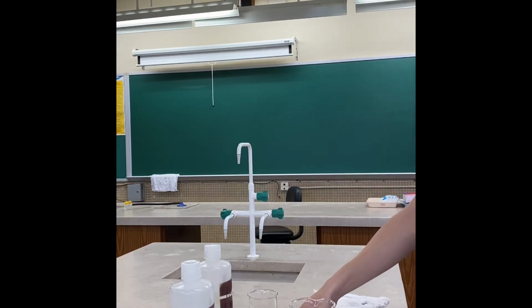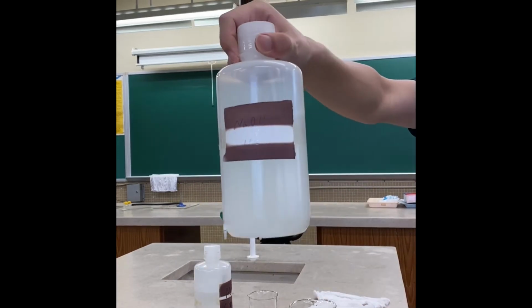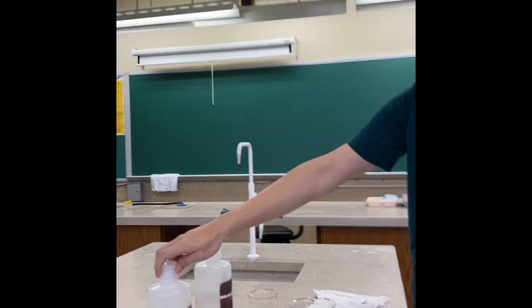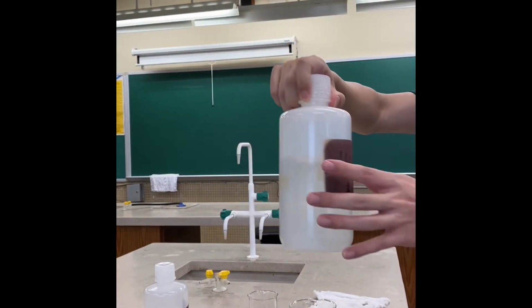Then you have to wash each of these two pipettes with the corresponding solution. The first one is sodium hydroxide at 1 M, and the second one is 1 M HCl.